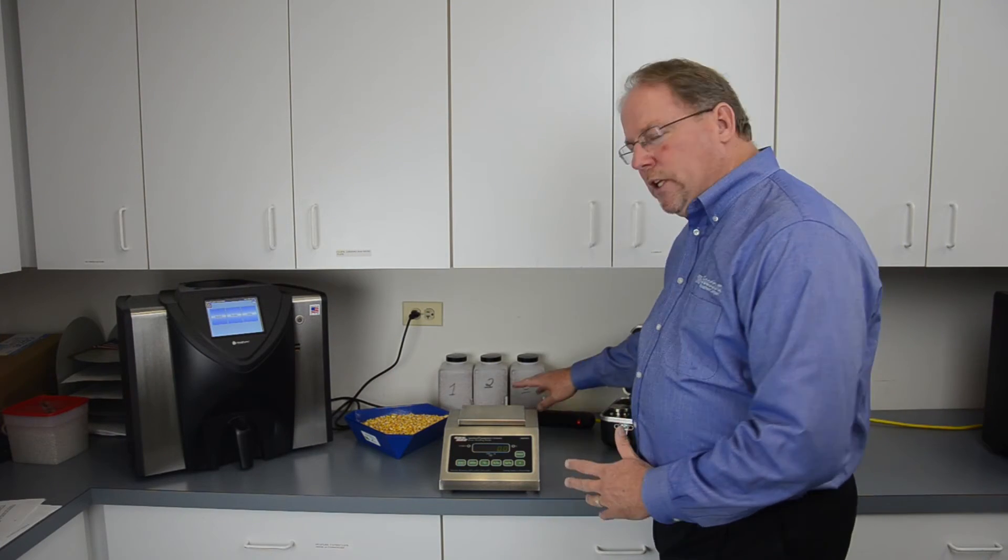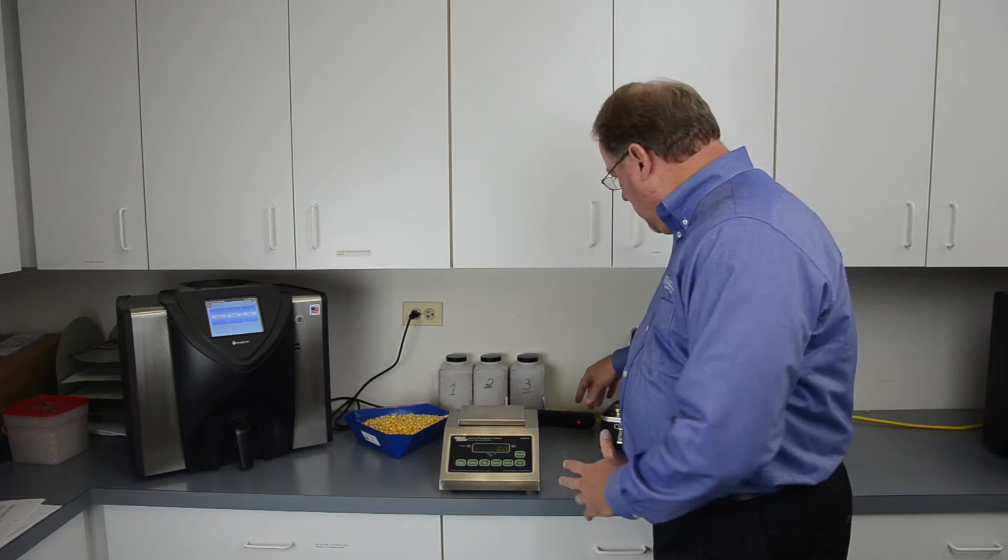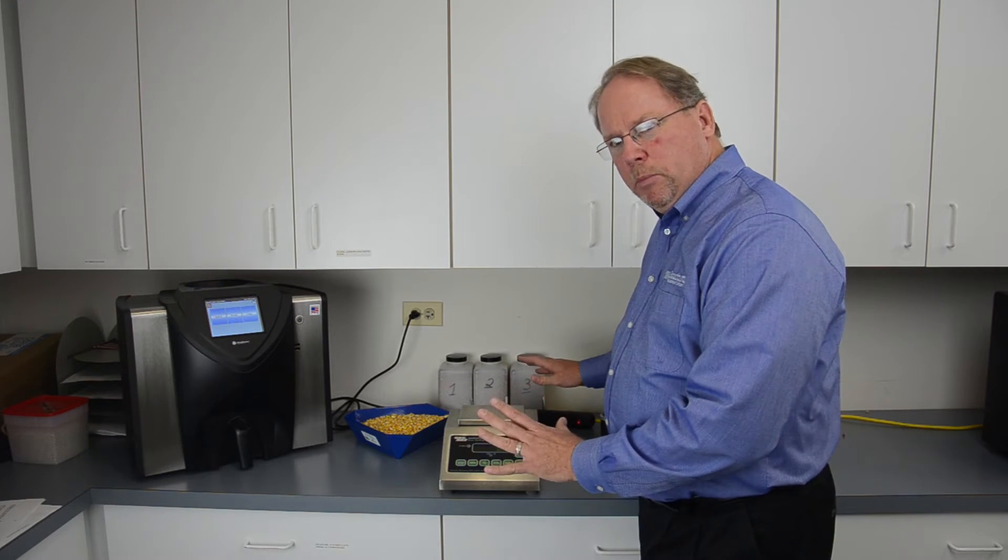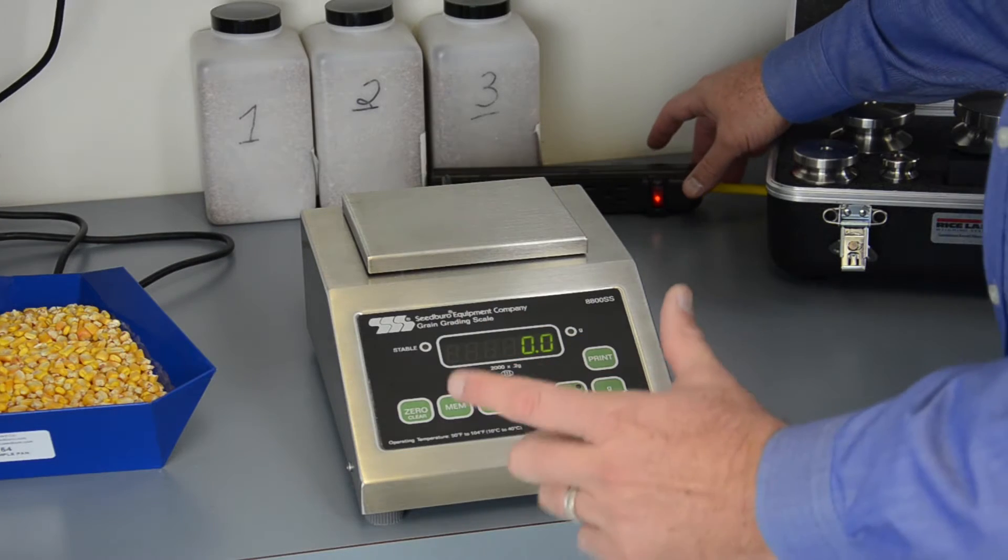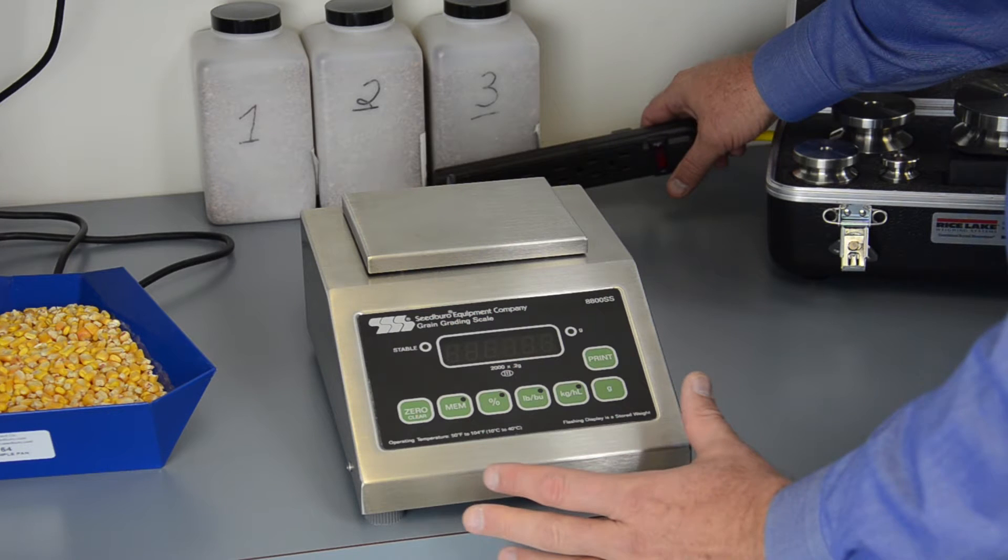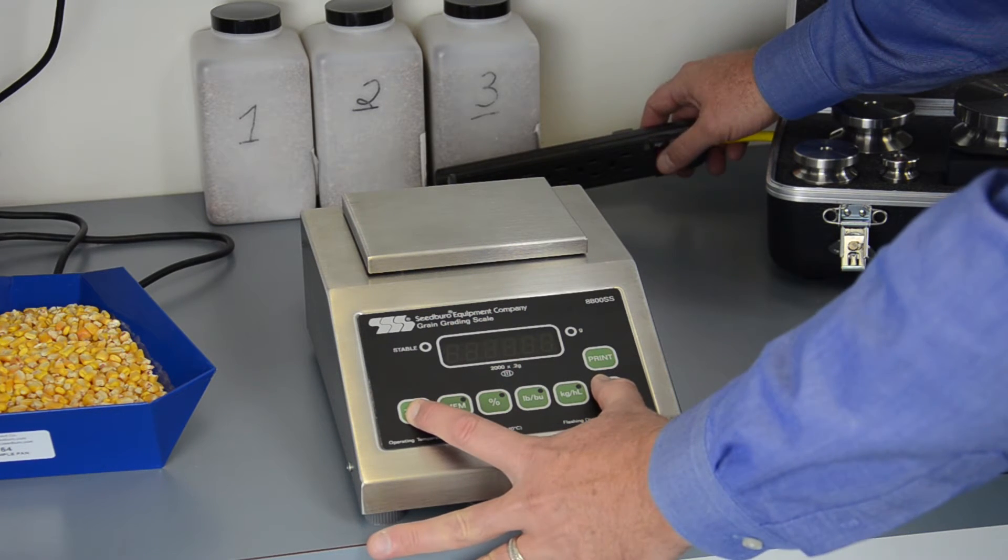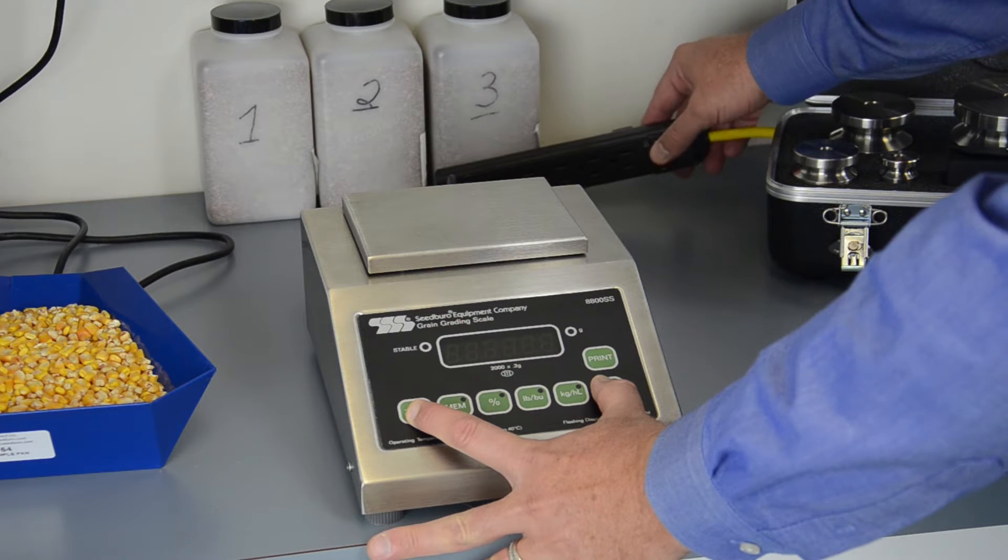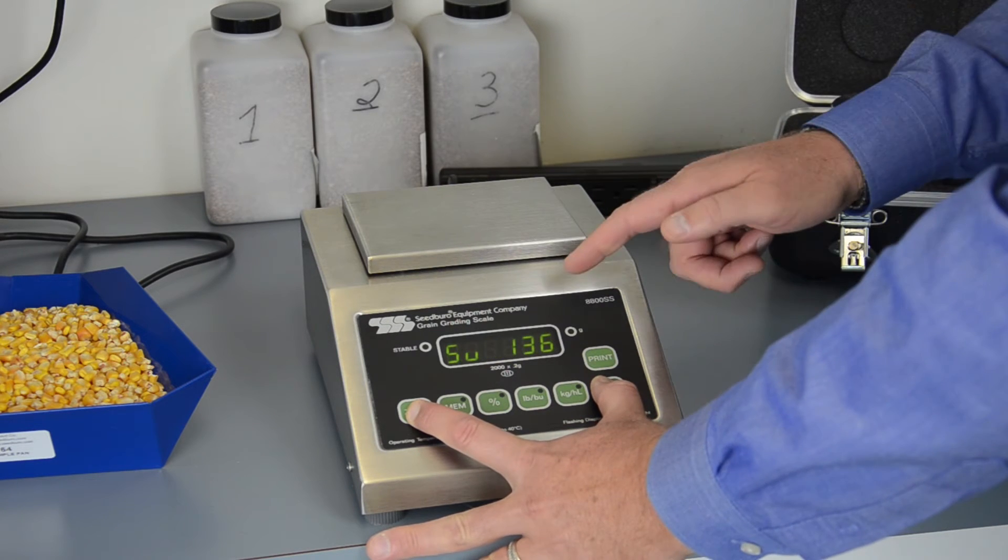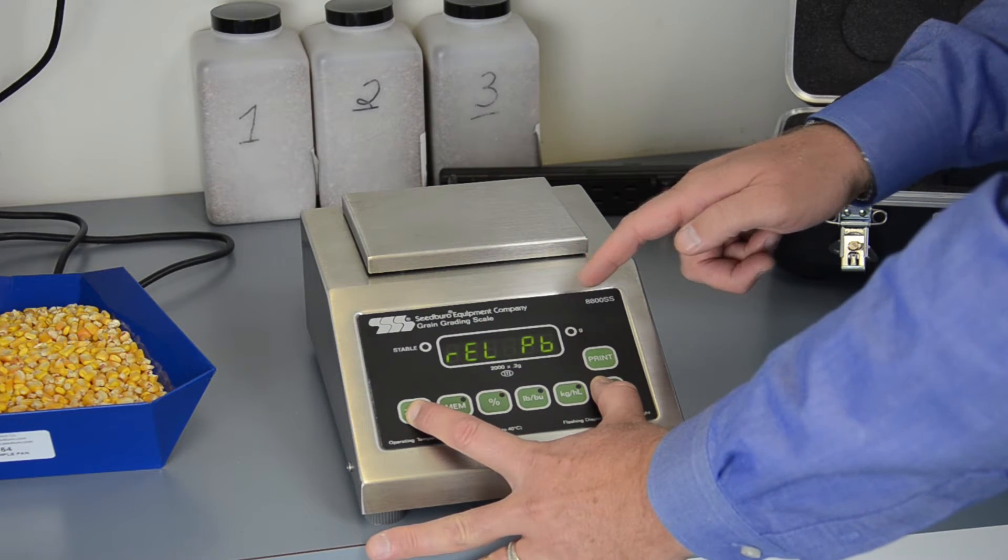The process starts with plugging the instrument into a power strip. For those with three hands, it's not a problem, but I only have two. So you have to shut the instrument off first, hold the zero and gram button, turn the instrument on, and when the display shows the revision level PB, you release.